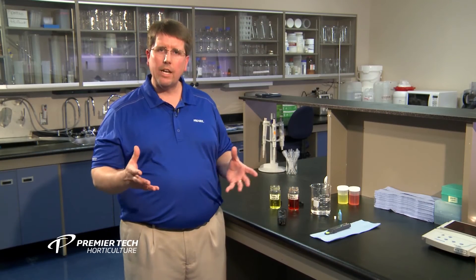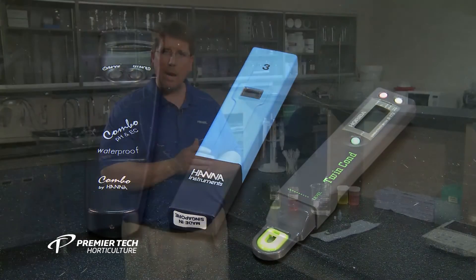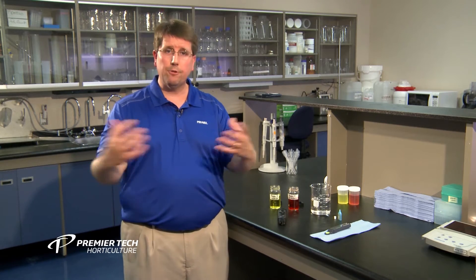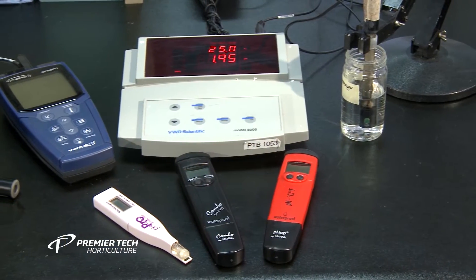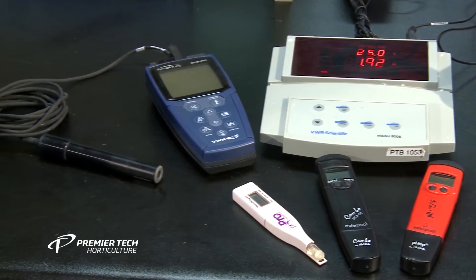As you can see, there's a wide variety of pH meters available on the market today. There are basically three different types. Represented here are your pen types, which are your most common. They're very portable — you can take them where you need to go, out in the greenhouse or wherever you are preparing a sample. There's also a desktop type, which stays stationary; you bring the samples to that and do your testing.